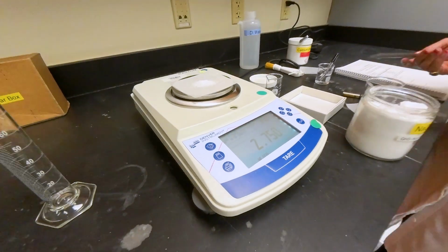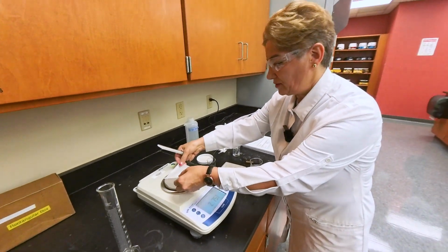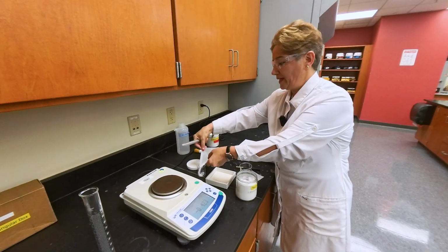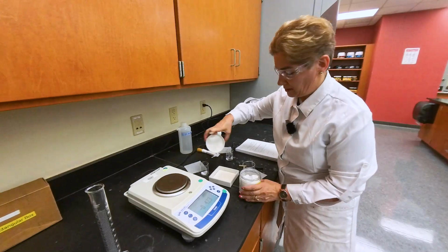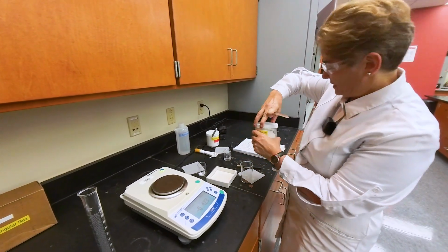That's it. Okay. We are not returning this to the container. It's going to go to the chemical waste later, but for now I'm placing it in that beaker. Make sure all the containers are closed at all times unless you are using them.